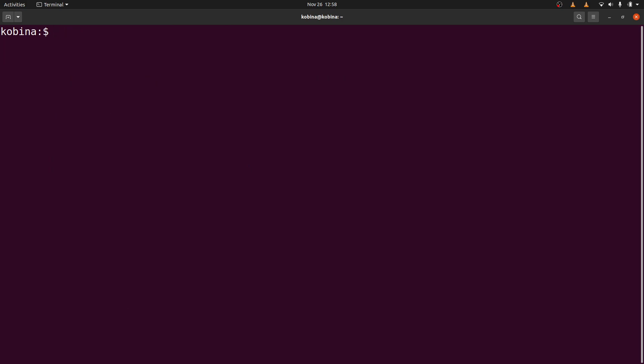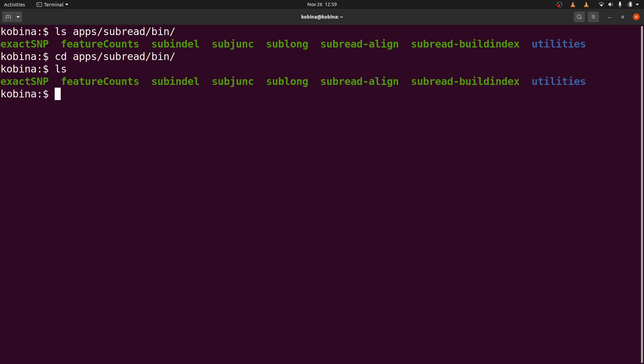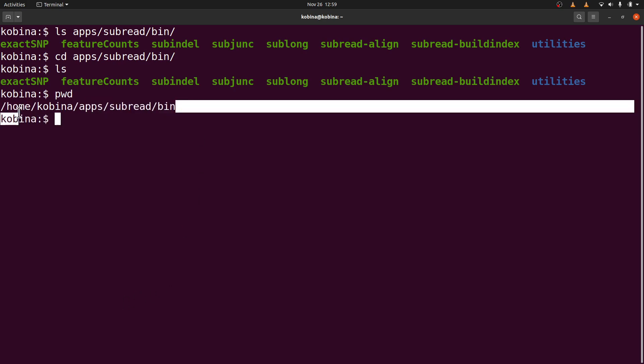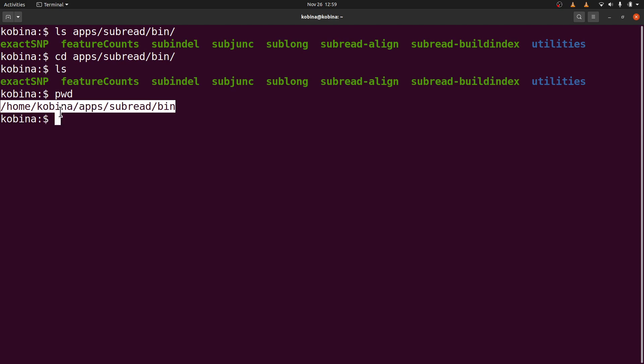So I will cd into this directory, apps subread bin. So I'll do that here. So I will cd apps subread slash bin. And do an ls again to see the files. Now I'm going to get that path of the featureCounts. So I'll say pwd. I'll get this path. This is the absolute path. So this is what I need. You should also get yours. Yours is likely to be different. So make sure whatever you see there, you copy it. So I'll copy mine. And then I'll move to the home directory again. So I'll say cd.